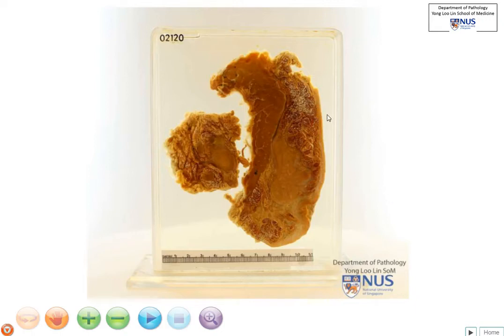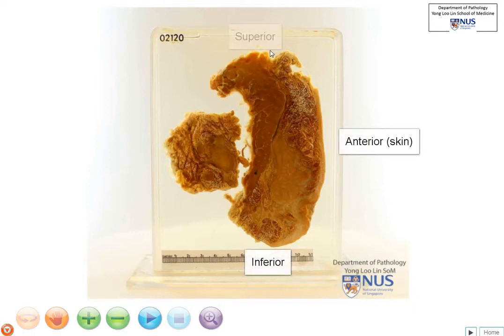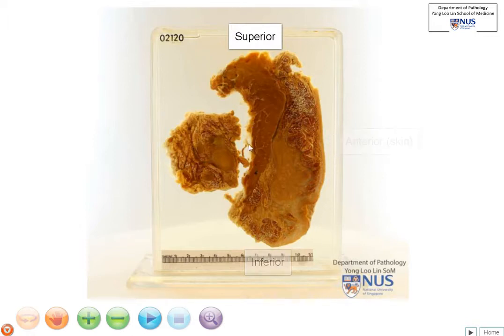This is the slice of a breast. This would be the superior, this would be inferior, this is anterior, and this is posterior. So let's look at the normal structures first.